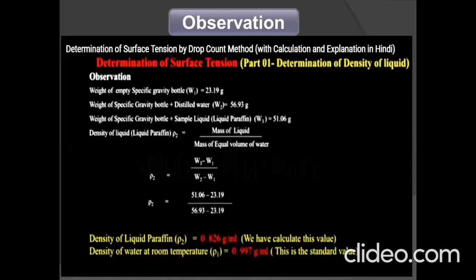Actually, the whole procedure is divided into two parts. Part 1 is the determination of the density of liquid, and the second part is the determination of the surface tension. So in the first part, there is a determination of density of liquid.